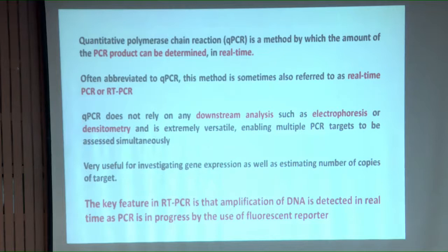The key feature in RT-PCR is that the amplification of DNA is detected on a real-time basis as the PCR is in progress, right? So you should understand how the PCR is really performed. Anybody having any doubt on that? If you don't understand how the PCR is really working, you will find the qPCR difficult, right? How does the PCR work?